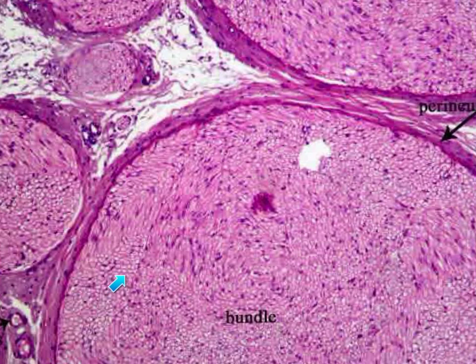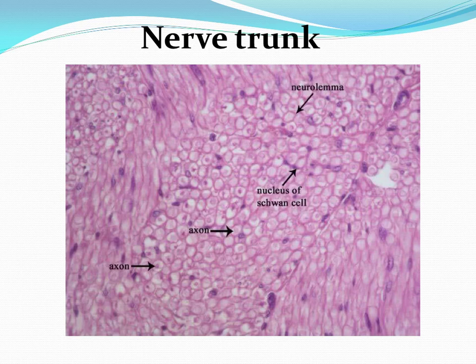The nerve fibers here appear as these circles having a white content inside, representing the dissolved myelin sheath, and you can see also nuclei representing nuclei of the Schwann cells. This is also another picture for the structure of the nerve trunk. Here he is magnifying the nerve fibers.